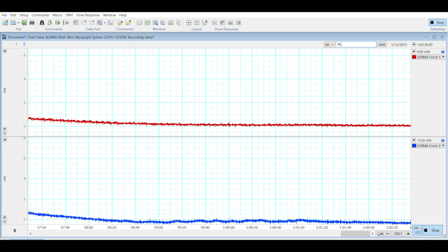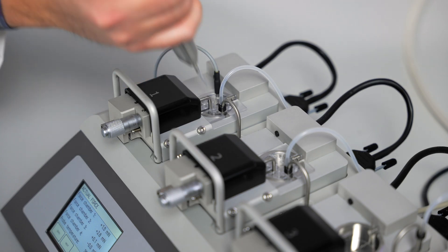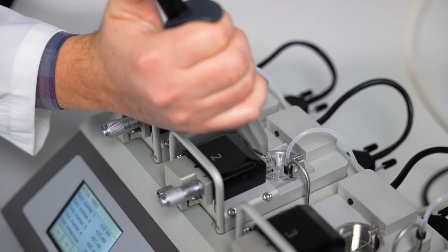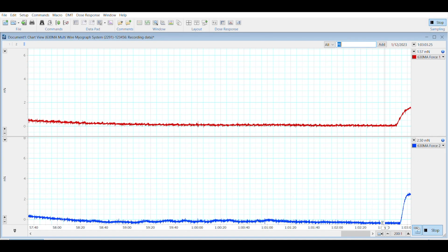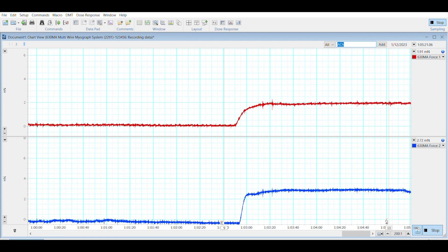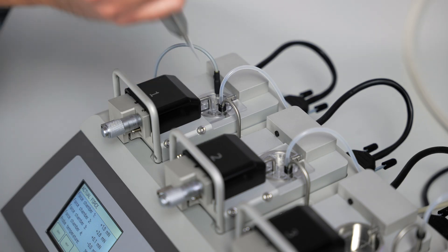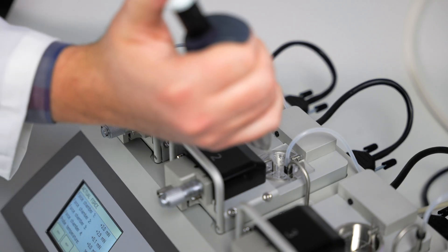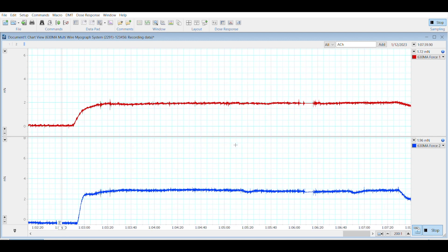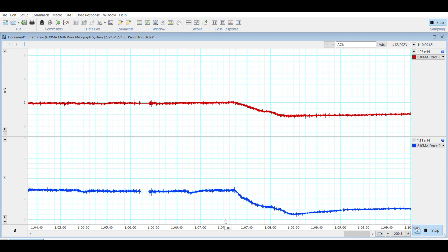Twenty minutes after our last washout we will now add phenylephrine for an agonist constriction. After you have reached a nice plateau with your phenylephrine you can then add acetylcholine for a relaxation. After the agonist relaxation we are now going to conclude this abbreviated experiment.